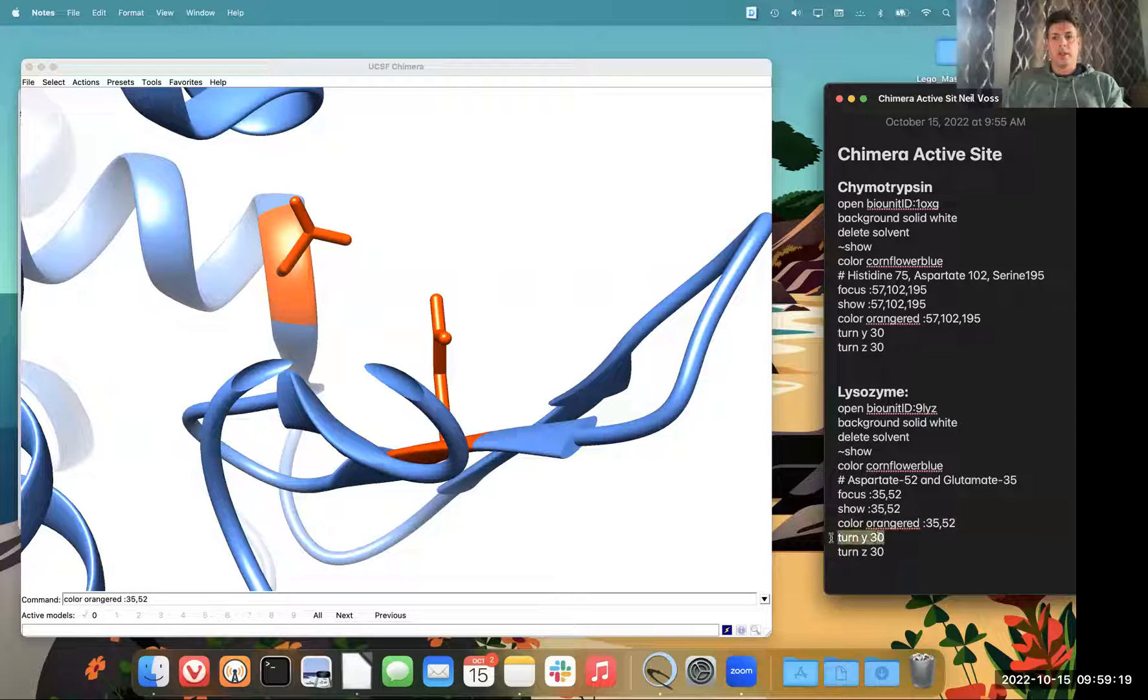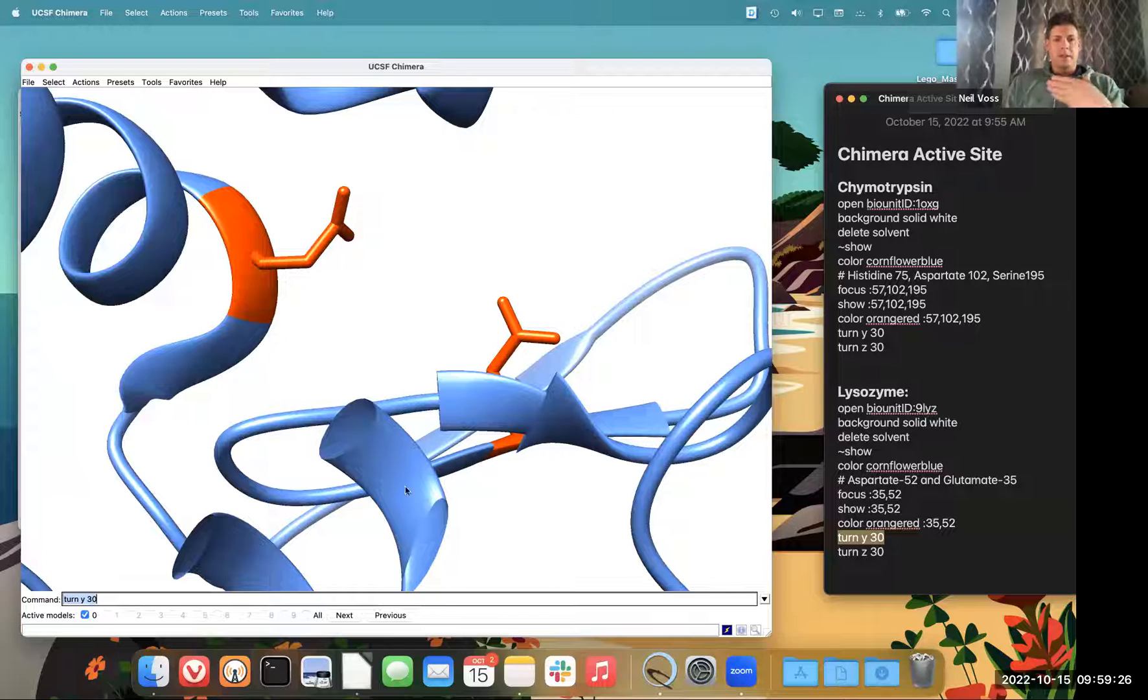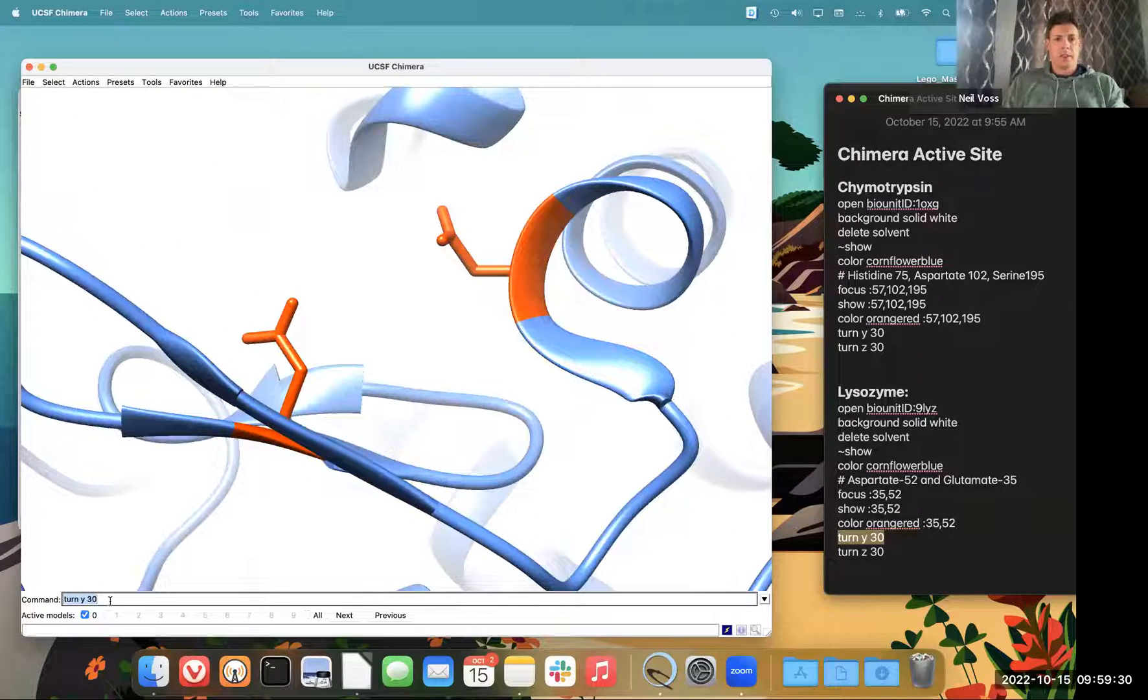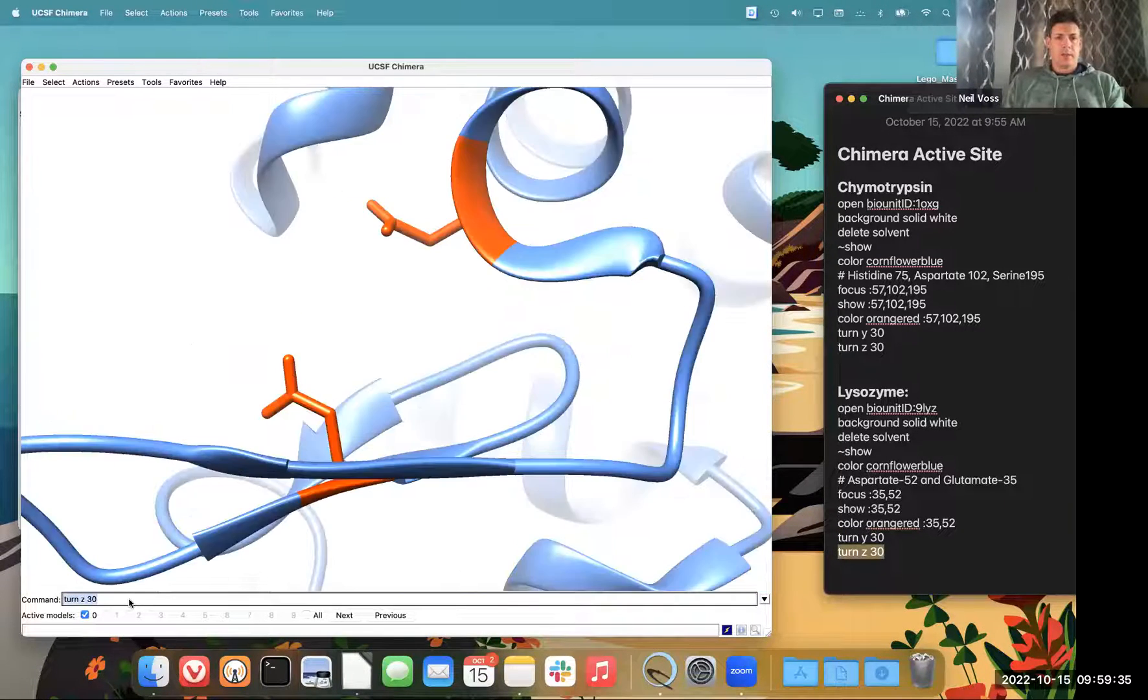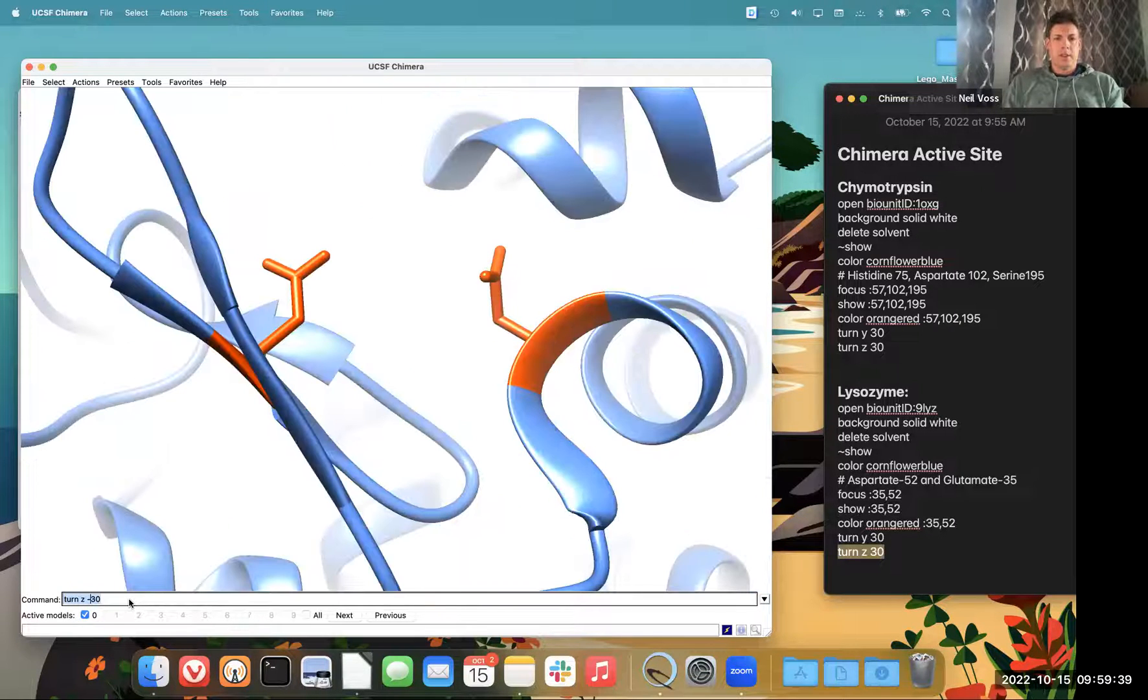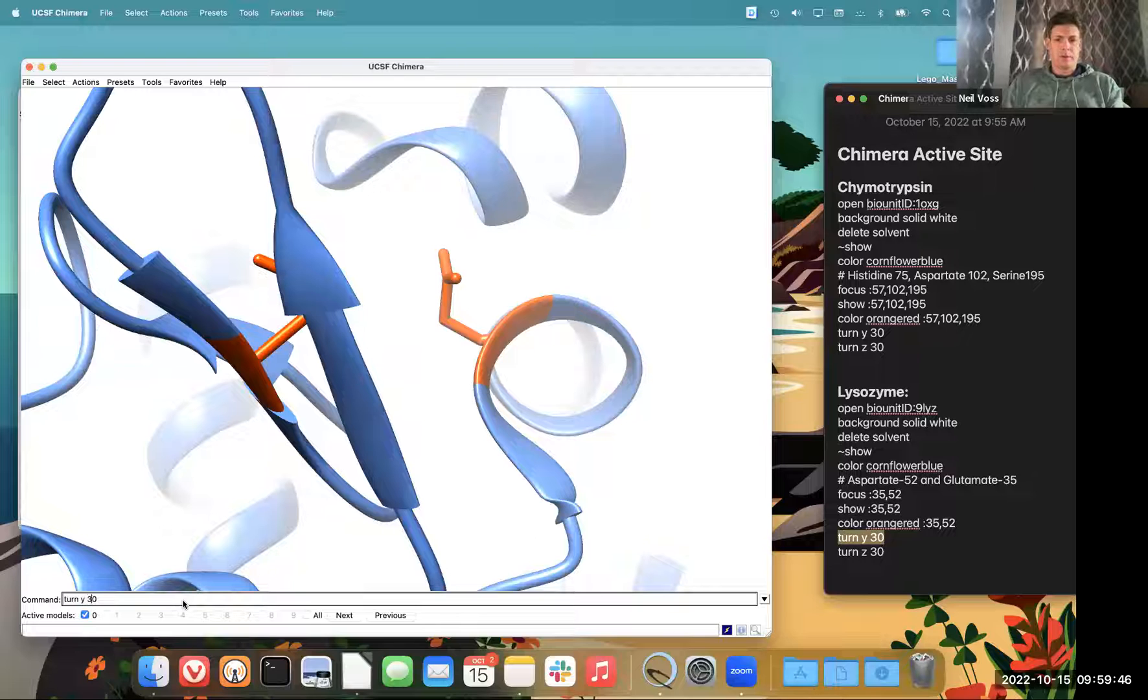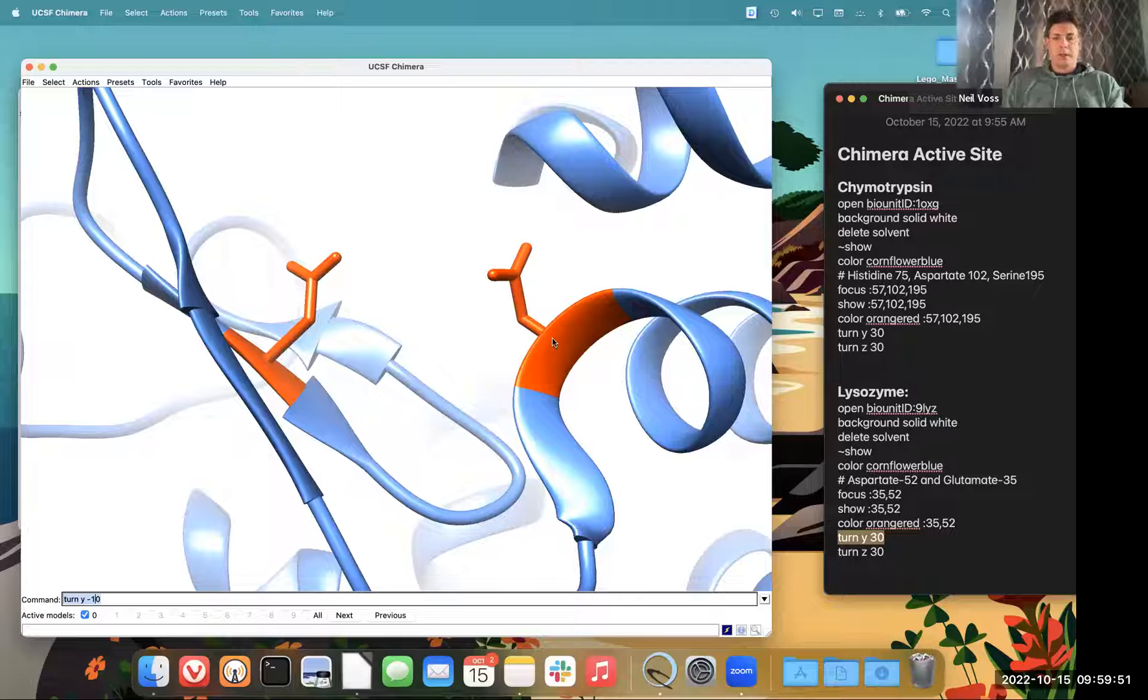So I like to turn things about the y axis just to kind of get them where I want. So it looks like there's a lot of stuff in front. So I'm going to turn y just a little bit more. I'm going to go with a negative 10. These are degrees.